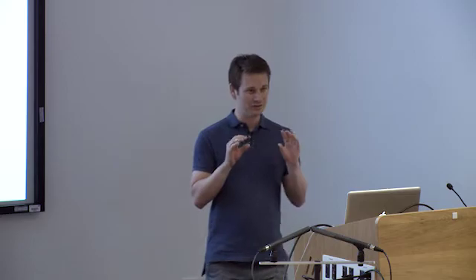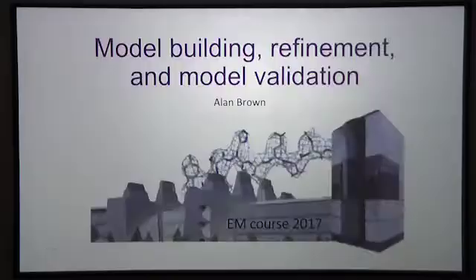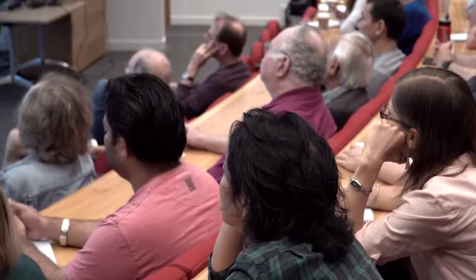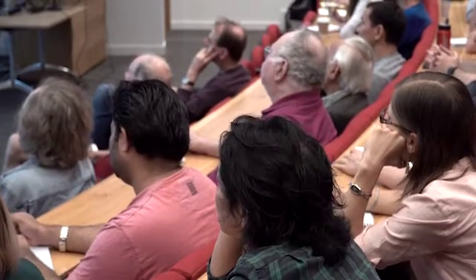Okay, thank you. So back in the early days of cryo-EM, interpreting a map was really easy. You just squinted your eyes and described the features of the map that looked like the human body. And if you were British and found that too personal, a teapot, things that we were comfortable with. And that's why in structural biology, terms like handle, spout, head, arm, body, knob dominate.